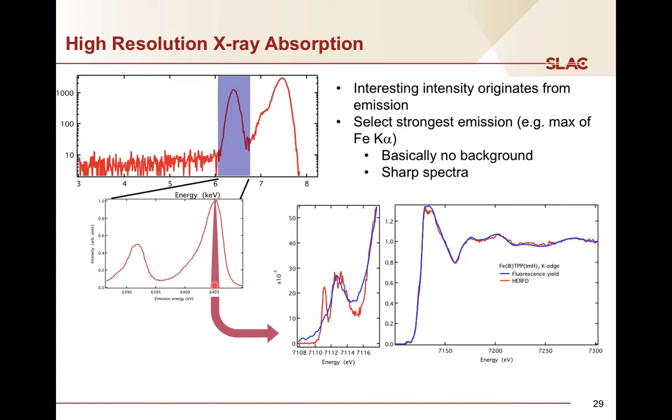And when you now take the data, you see here very clearly the T2g peak. The price you pay is you lose intensity. However, this here is very sloppy data that I took some time ago. That was done very fast. If you just measure it a little longer, it will be super smooth. But even with that data quality, you see very, very clearly the T2g peak here.